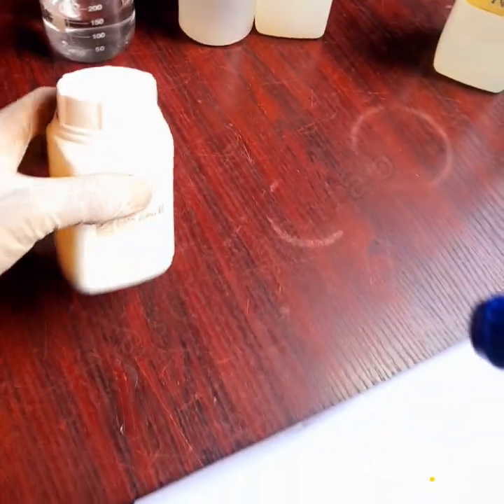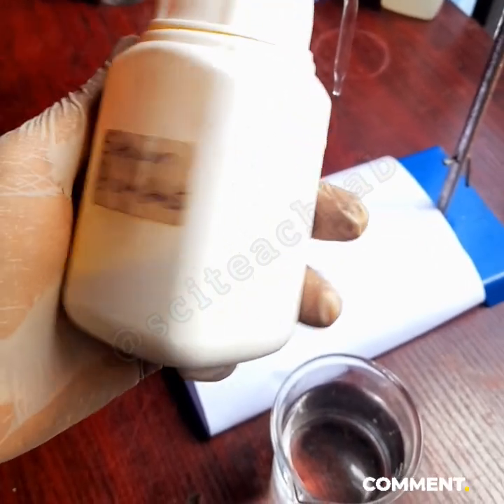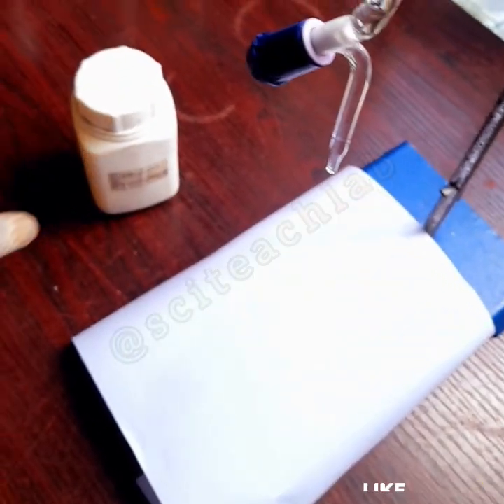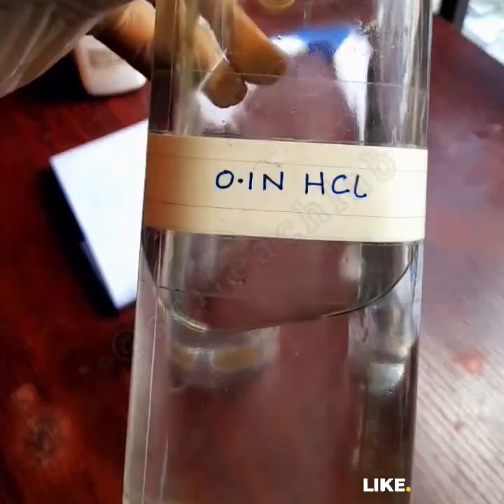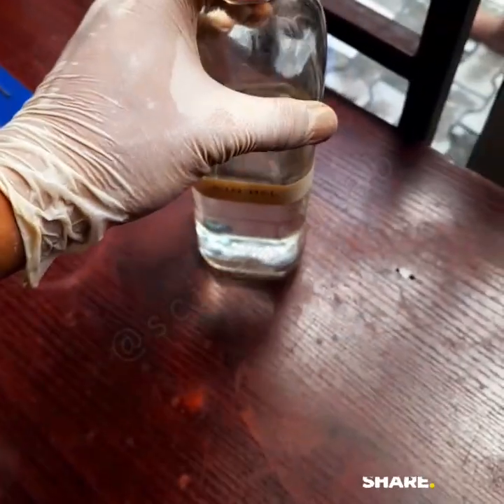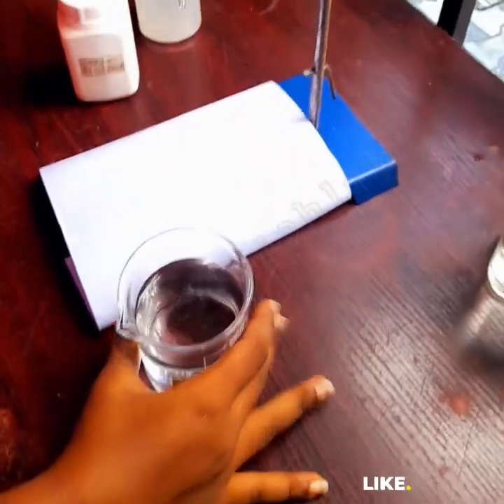Then this is my sodium bicarbonate, so I'll dissolve this according to the standard measure and then use it as my B. So I have my distilled water and I have my acid where I reduced the A from.